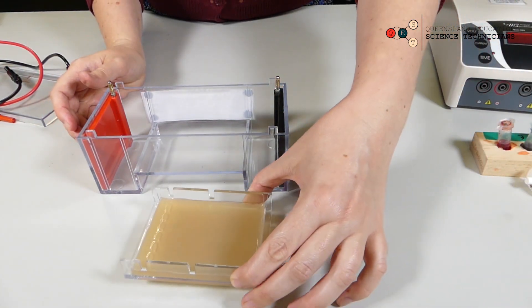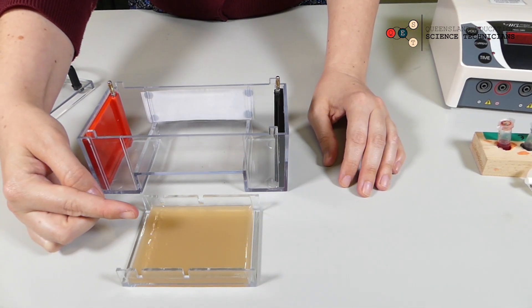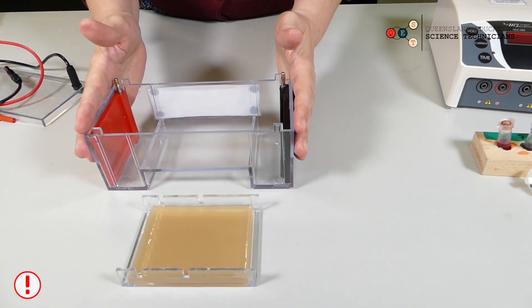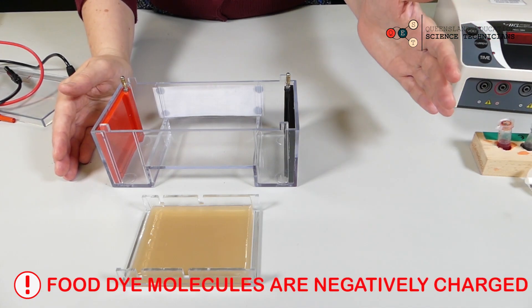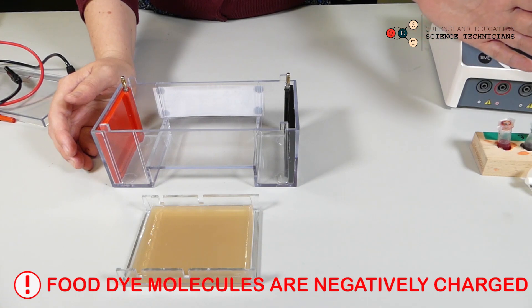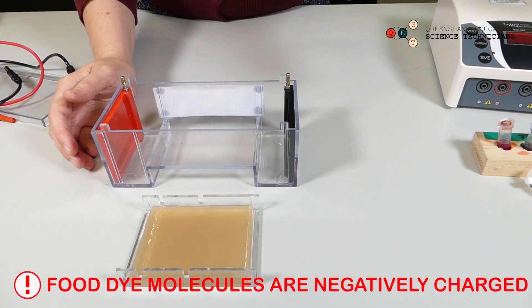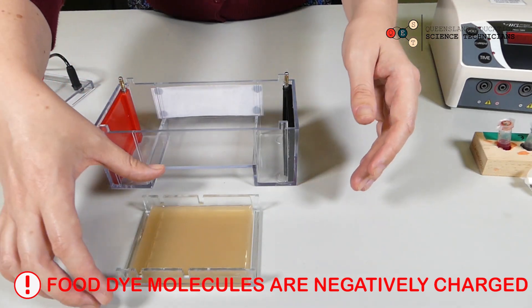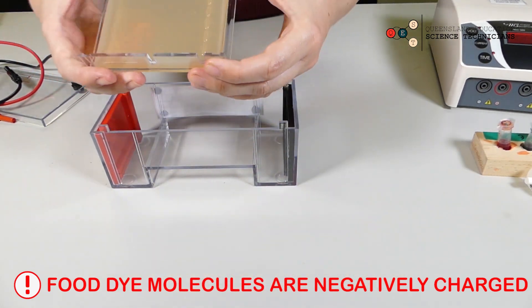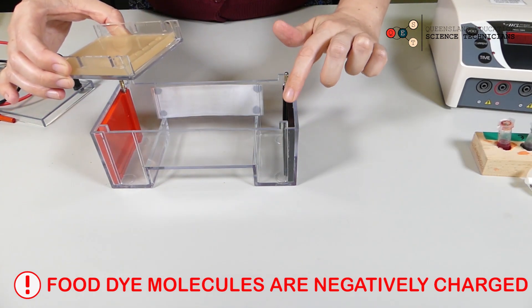Now it's important that we put the holes that we've made in the gel at the right end, because when we introduce an electrical current all of our food dye is going to want to move in one direction. If we put it in the wrong way around, it'll just move off the end of the gel and into your buffer solution. So we need to place this in our electrophoresis chamber with the wells next to the black end.